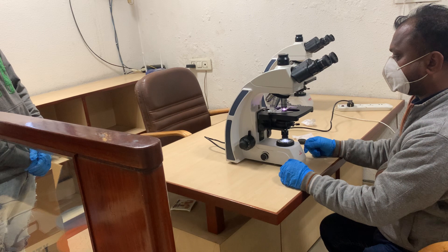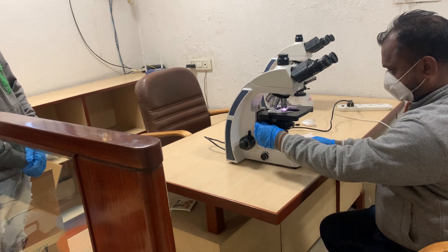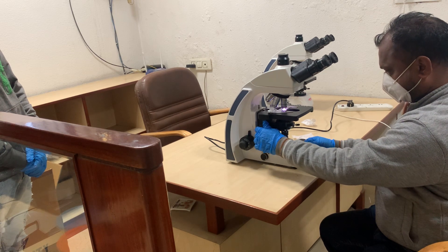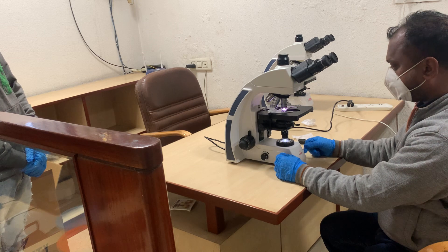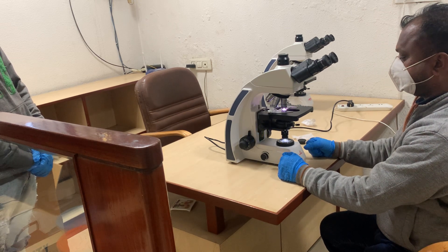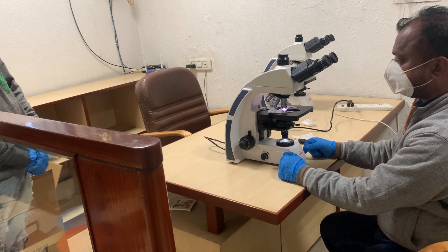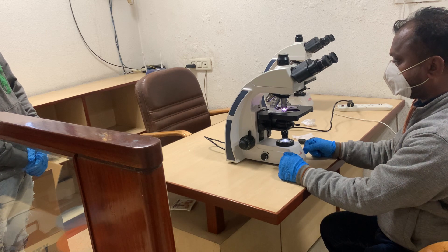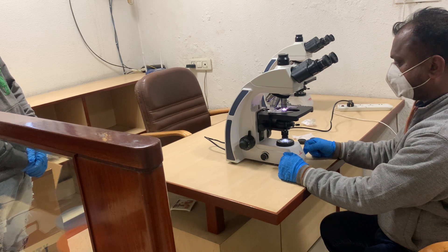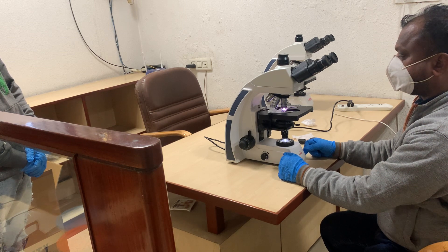It also comes with condenser motion, and the condenser has apertures marked on it. If the objective is at 4x, the aperture should be on 4x; at 10x, the aperture should be on 10x; at 40x on 40x; and at 100x the aperture should be at the 100x position. It also has a coaxial focusing control.